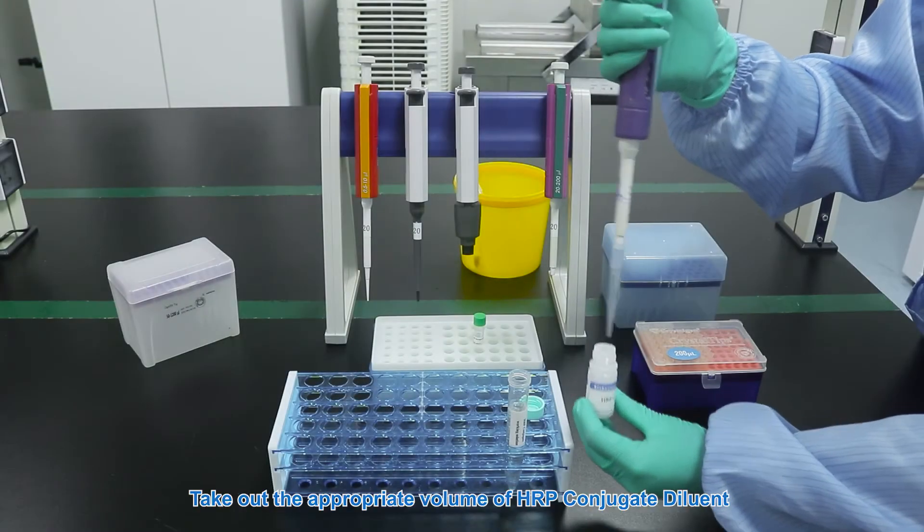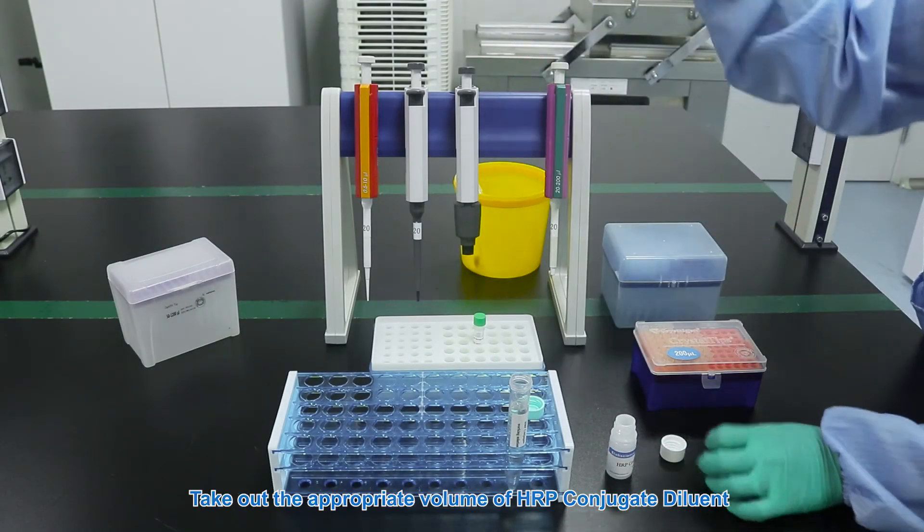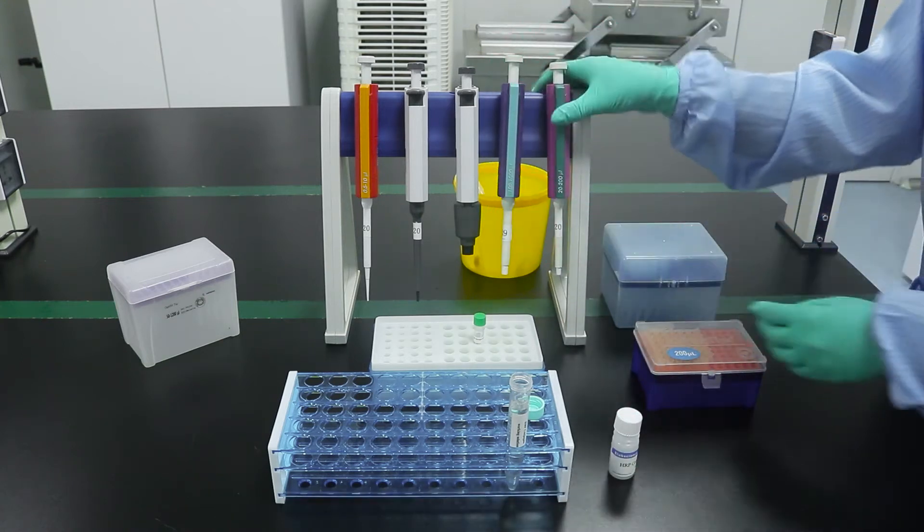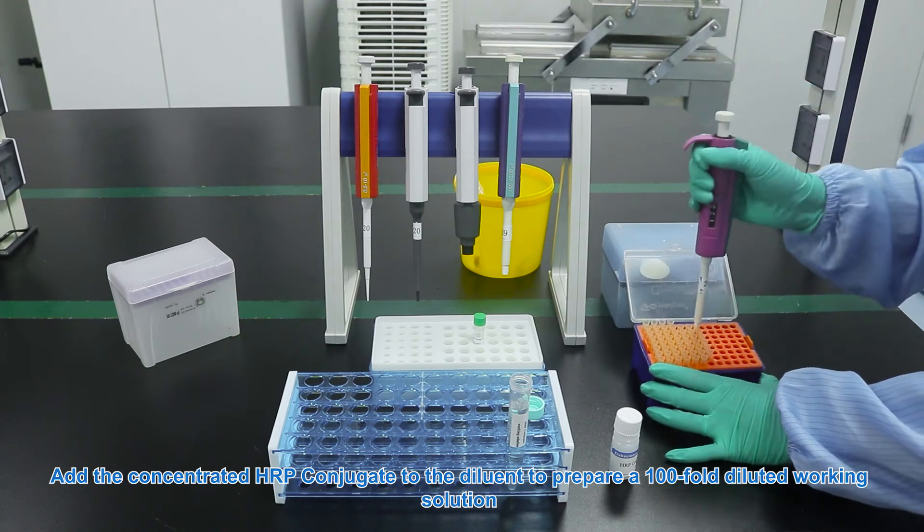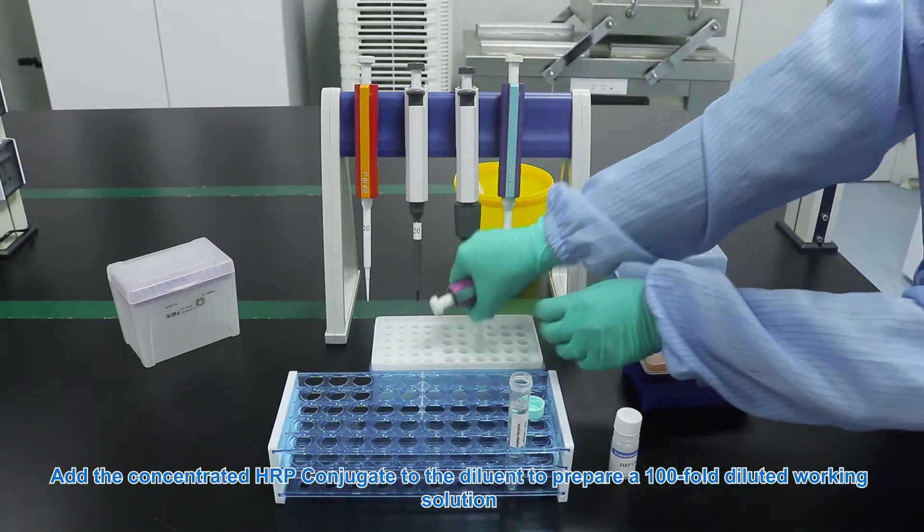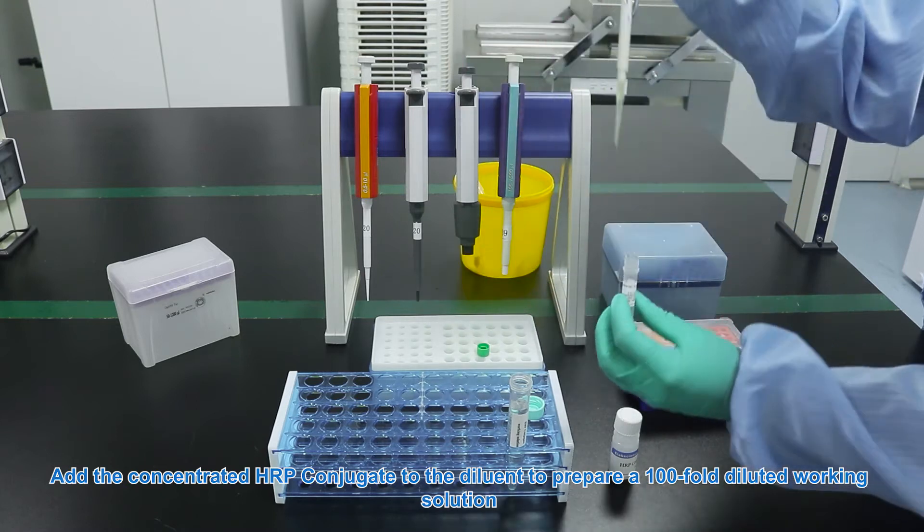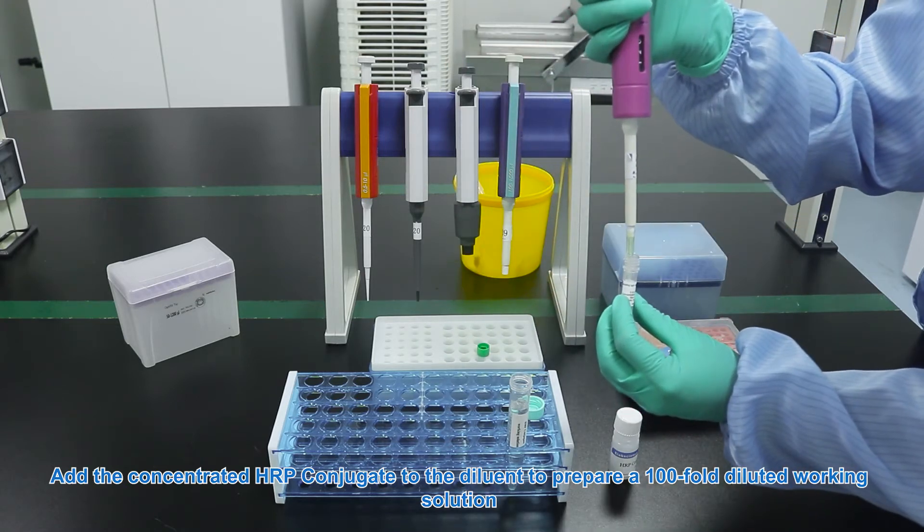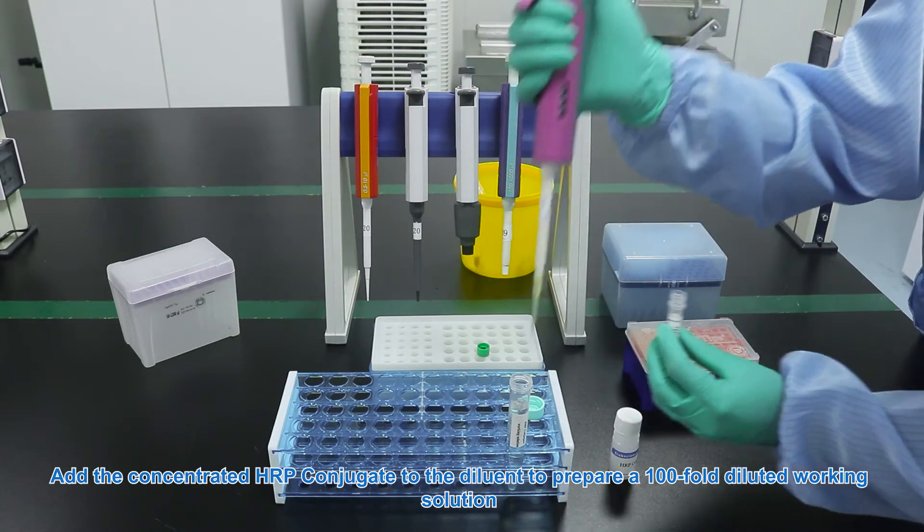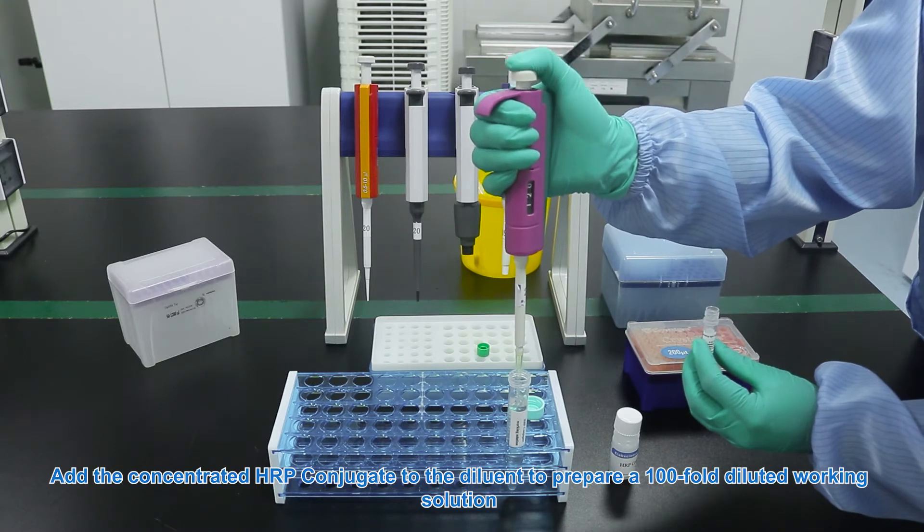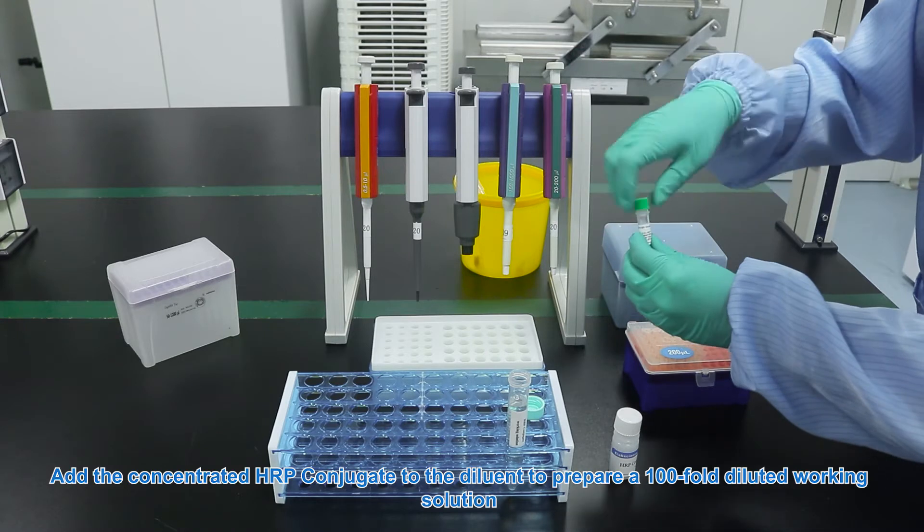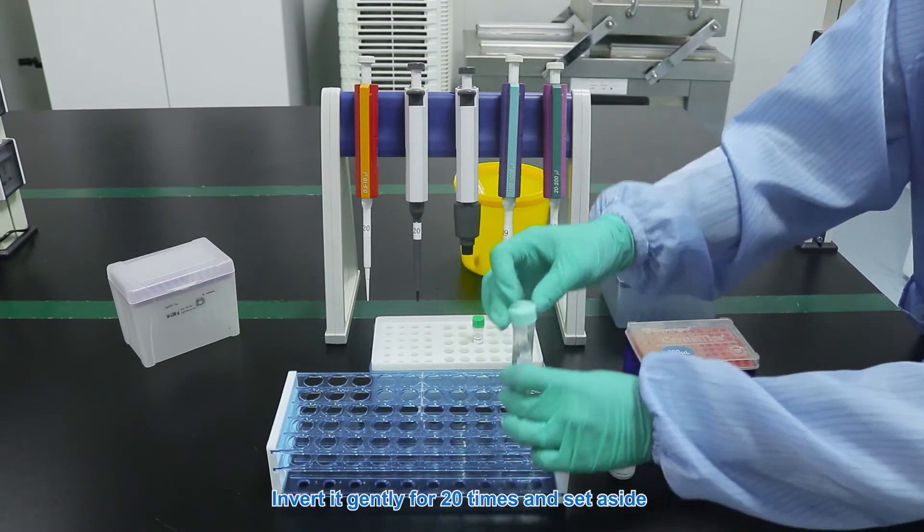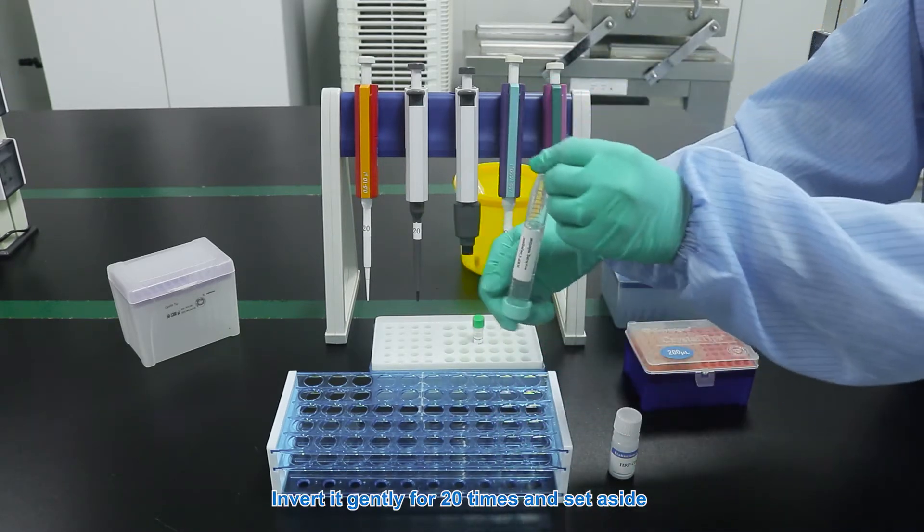Take out the appropriate volume of HRP conjugate diluent. Add the concentrated HRP conjugate to the diluent to prepare a 100-fold diluted working solution. Invert it gently for 20 times and set aside.